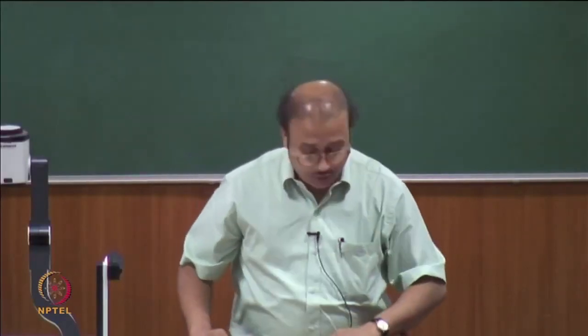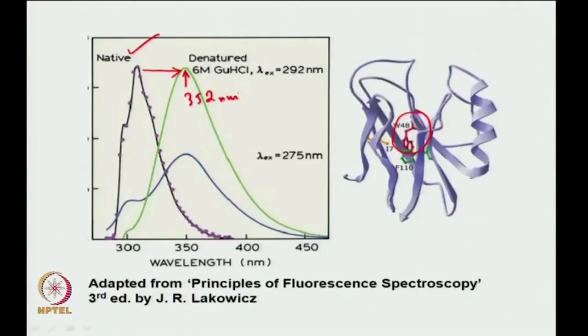So the other way, I can look at this one, isn't it? One is, I looked at the decay or the decrease in intensity of the denatured state fluorescence. The other way is, I can look at the increase in fluorescence intensity of the folded state, which is at 305. So in that case, your fluorescence intensity would increase and then finally stop when you have reached the end.